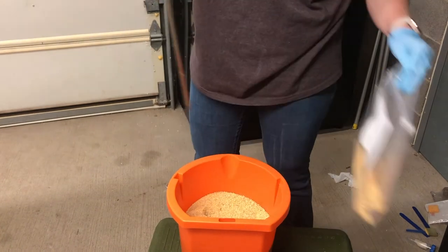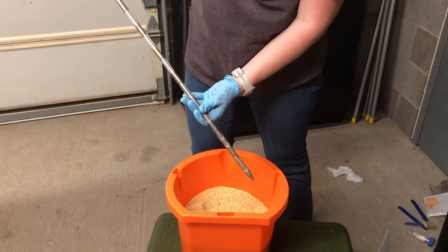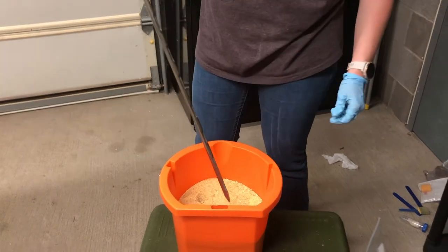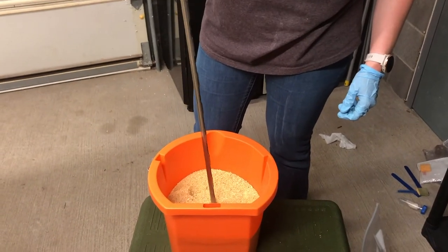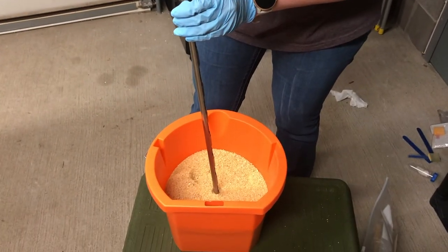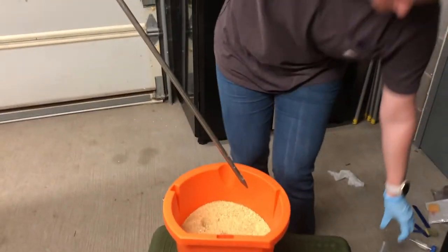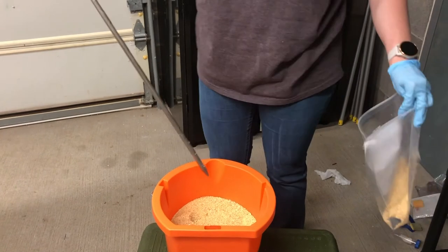When taking a second sample with the same feed probe, insert it at a varying depth from the last one. Insert the feed probe at half the depth or whatever depth you choose, then rotate the inner compartment to collect the feed sample and pour the feed back into the same plastic bag.